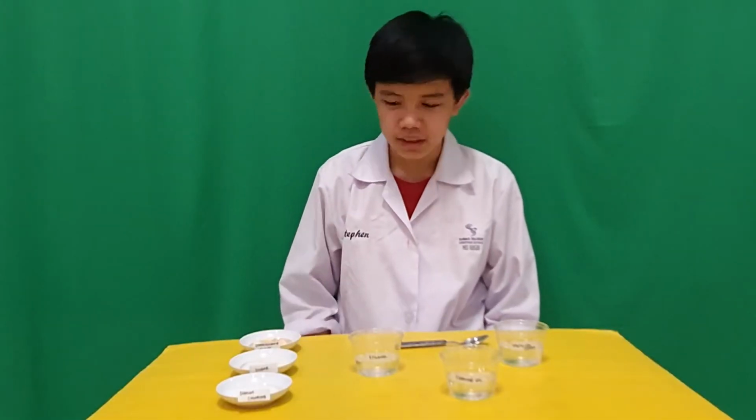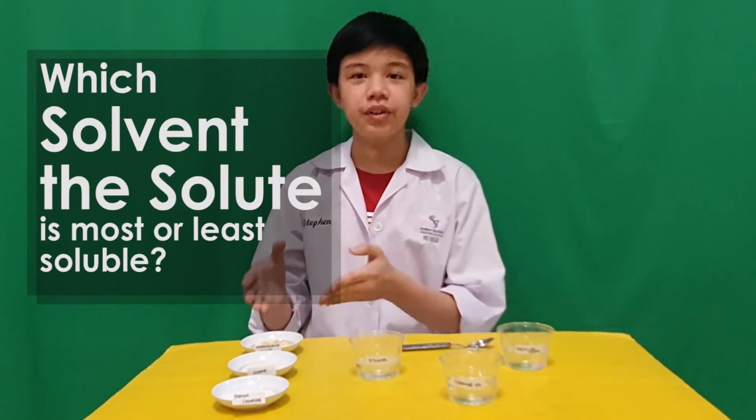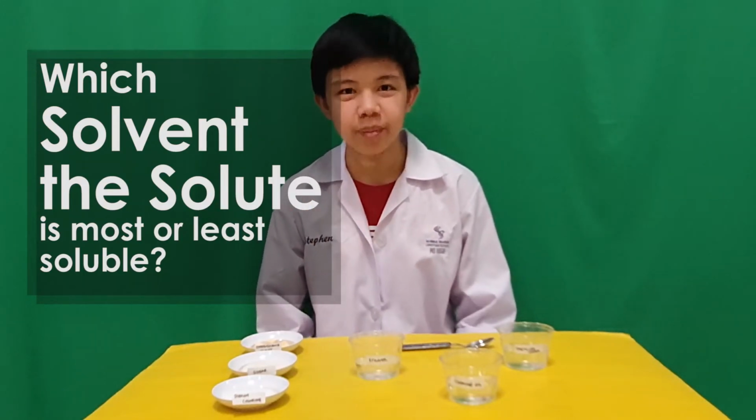And I think this experiment is really interesting. Let's give it a try. So the purpose of this project is to analyze in which solvent the solute is most or least soluble. Okay, come on, let's give it a try.